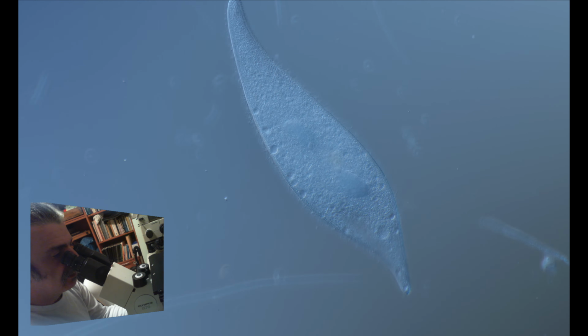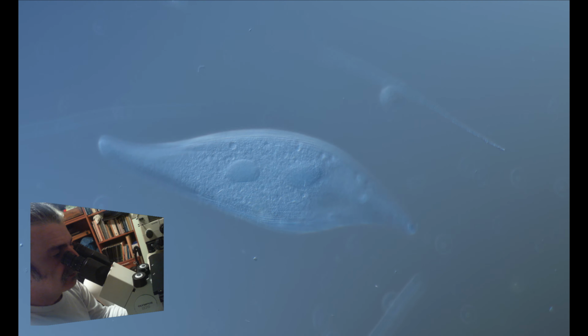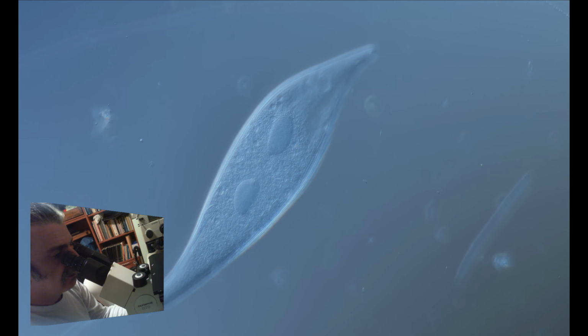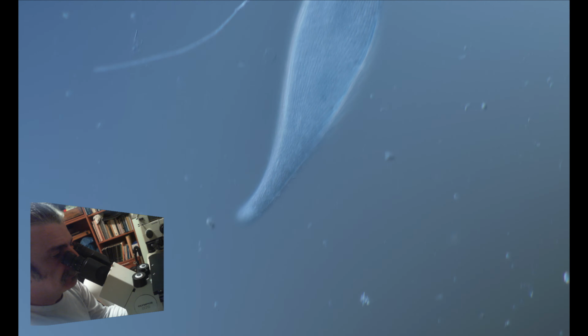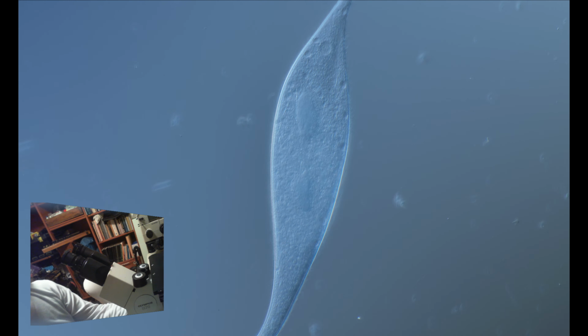Ciliates bear two kinds of nuclei, a macronucleus and a micronucleus. That's one of its characteristics. Beautiful Lionotus.